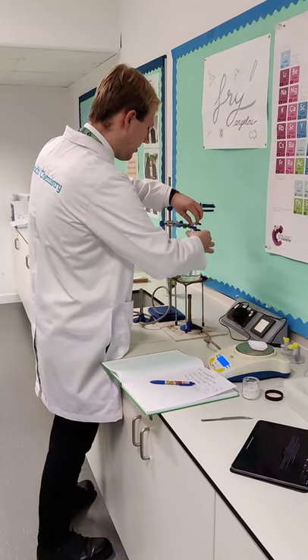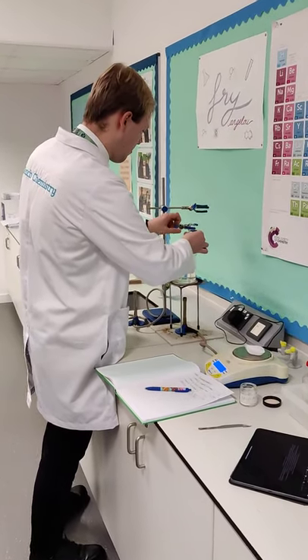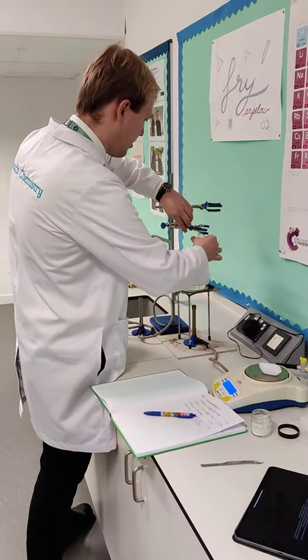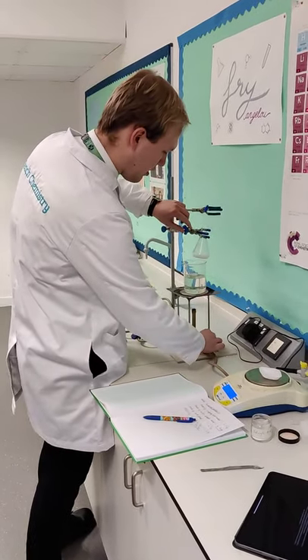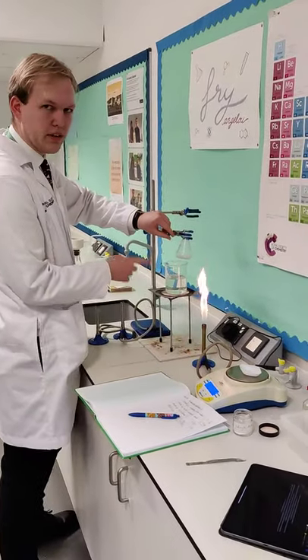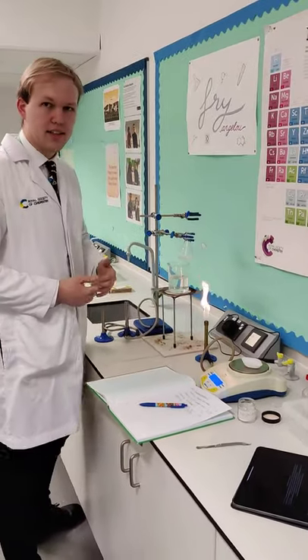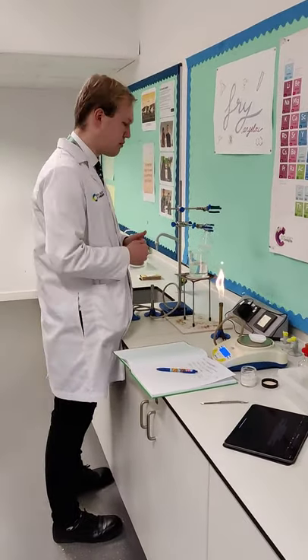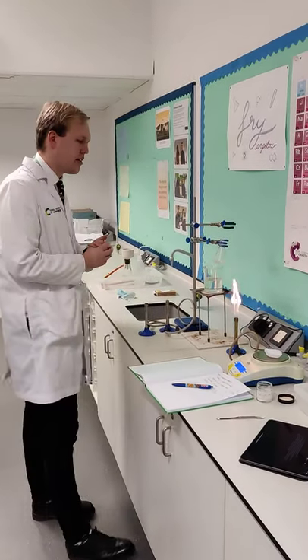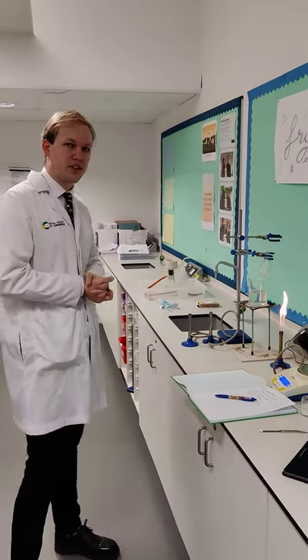Just giving it a little stir, making sure to be careful. Now just before I put this into the water, I'm going to take the Bunsen burner off because it's starting to boil. It's really important that this water doesn't exceed 65 degrees Celsius, so I'm going to wait a couple of seconds for it to cool down. Then I'll put it in the beaker of water for 20 minutes for the reaction to occur.